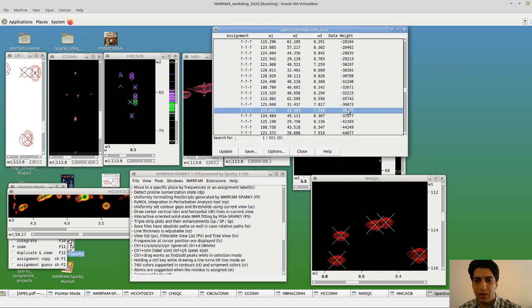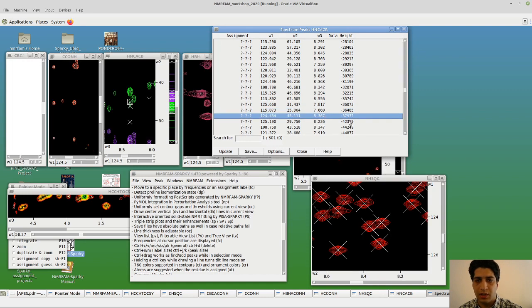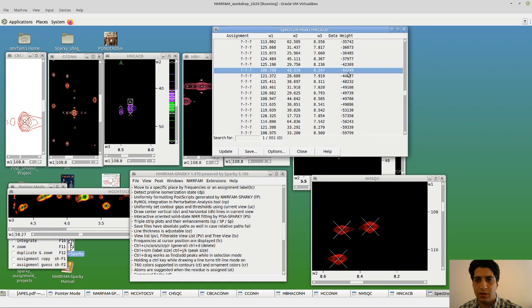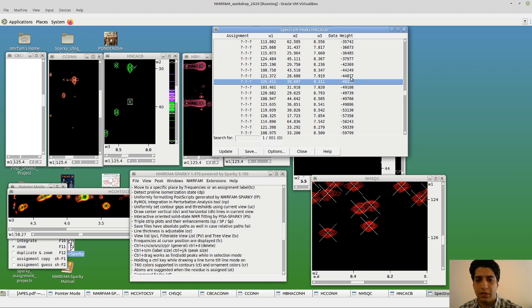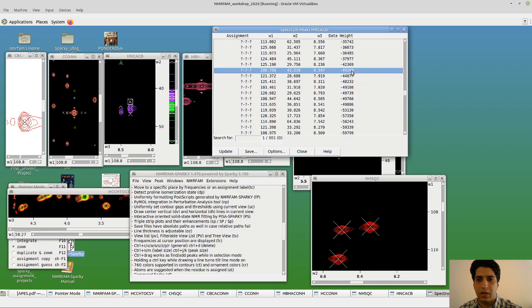Just continue browsing this until you see something that you are sure is a peak. So, okay, I'm going to stop around here.